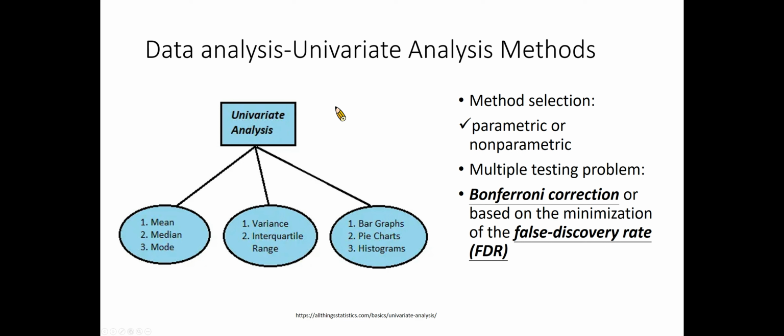The metabolomic data obtained from biological samples is often very complex, with the presence of correlation between features from the same metabolite and correlation between metabolites from the same pathway. Also, the effect of potential confounding variables like gender, diet, or body mass index is not taken into account by these analysis methods, increasing the probability of obtaining false positive or false negative results.